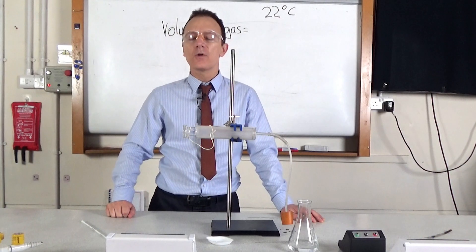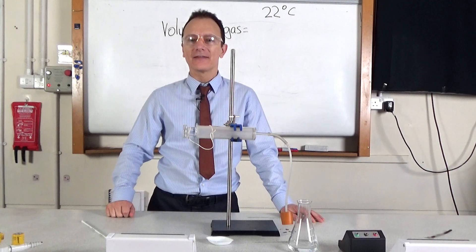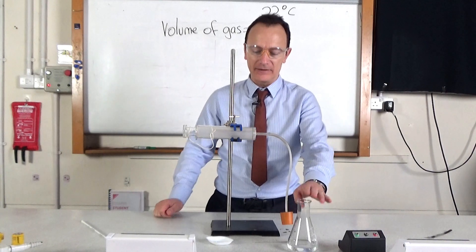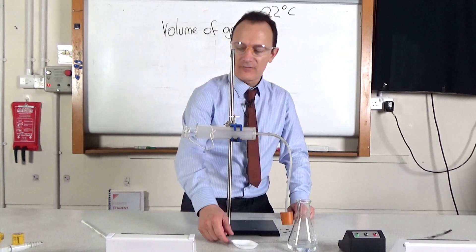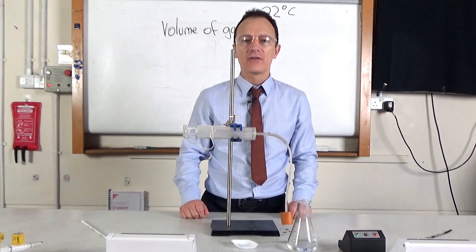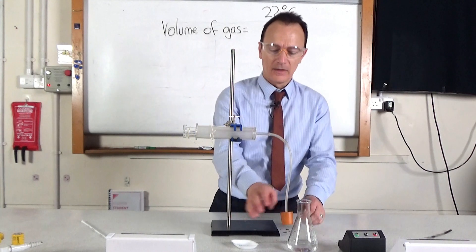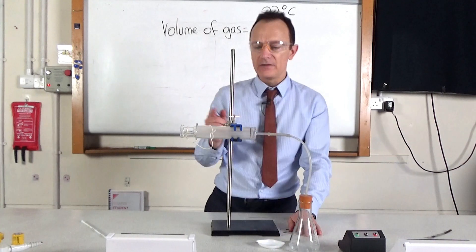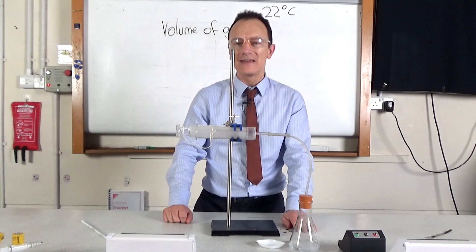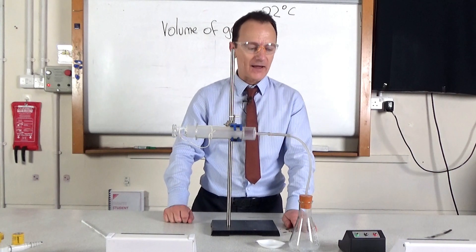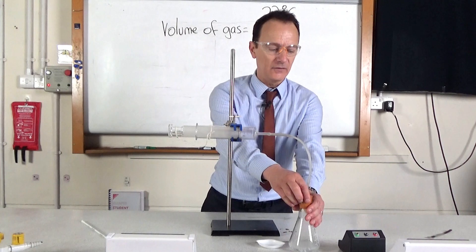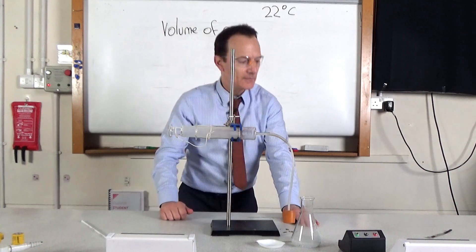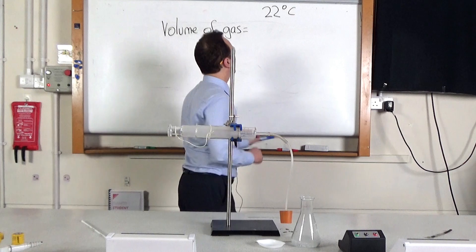Now I want to be a little bit quantitative and work out how much faster the reaction gets as we increase the temperature. So I've got here some hydrochloric acid at 22 degrees and I've weighed out 0.5 grams of magnesium. And I've got a gas syringe to measure the volume of gas that is made by the reaction. So I'm going to add the magnesium to the acid, start the stopwatch, and I'm going to use the gas syringe to measure the volume of gas made within the first 10 seconds of the reaction. So when the reaction gets to 10 seconds, I'm going to pull the bung out of the flask and now I can read off that it's produced 37 centimeters cubed of gas in that first 10 seconds.